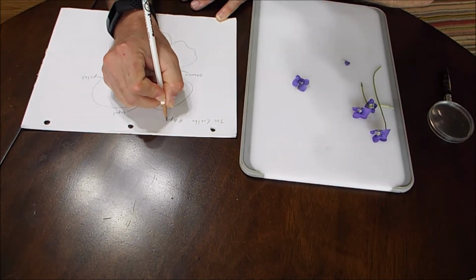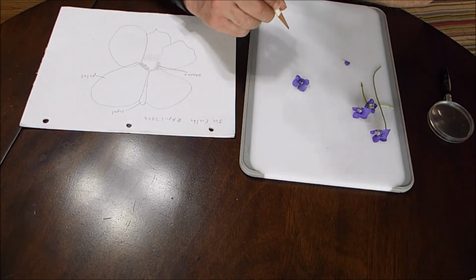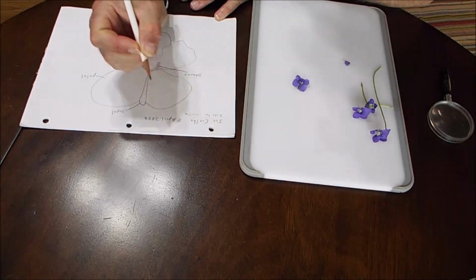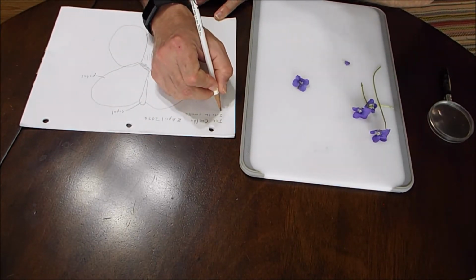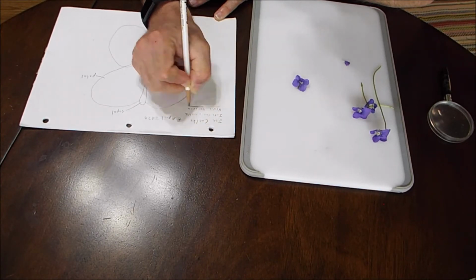And the date. And this is, what would you call this view of the flower? Straight down the throat, that's not very technical. Into the corolla. The corolla is all of the petals, right? And this is again, Viola sororia. And I'll leave out the common name because we've got that in the last one.